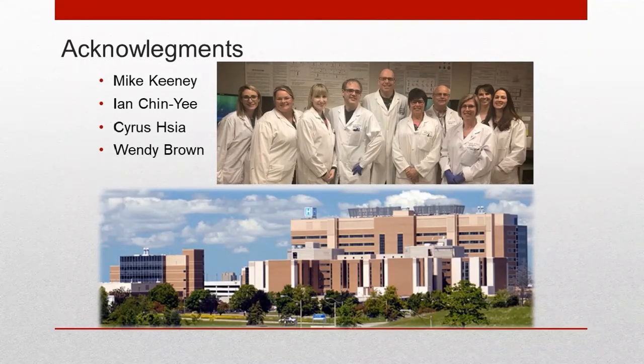So yes, you could, because I understand that running multiple settings files is arduous and having to set those up. But we do run different numbers of antibody combinations on 10-color settings files, so we don't necessarily run 10-color panels all the time on a 10-color settings file.